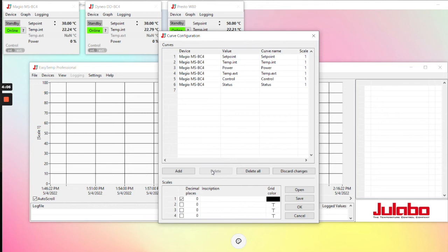A couple of these won't give me a reading that I want to necessarily see, so I'll get rid of those currently. On the free version, you can only graph 4 graph lines. So you would have to pick and choose which ones.